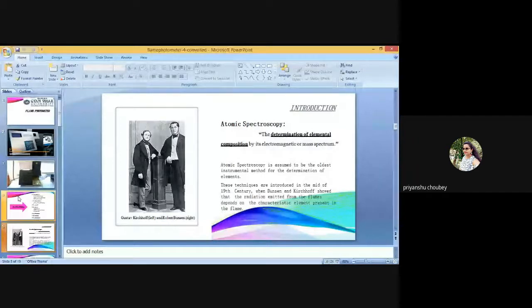flame photometers are operated with the help of computer software, and necessary operational parameters can be set through a keyboard command. The actual steps involved may vary with the type of the instrument. Therefore, the users are advised to consult the manual provided by the manufacturer.